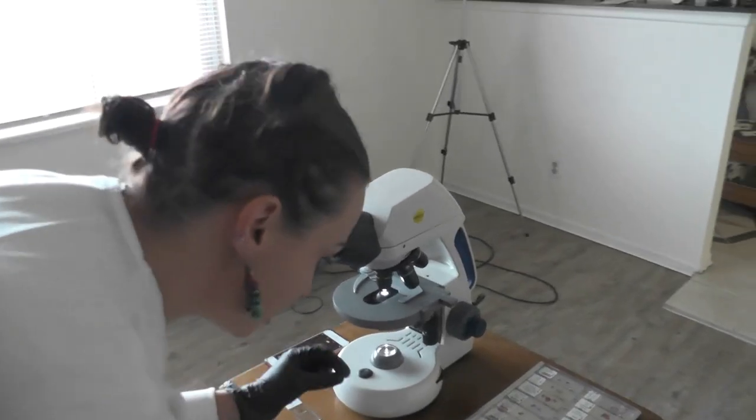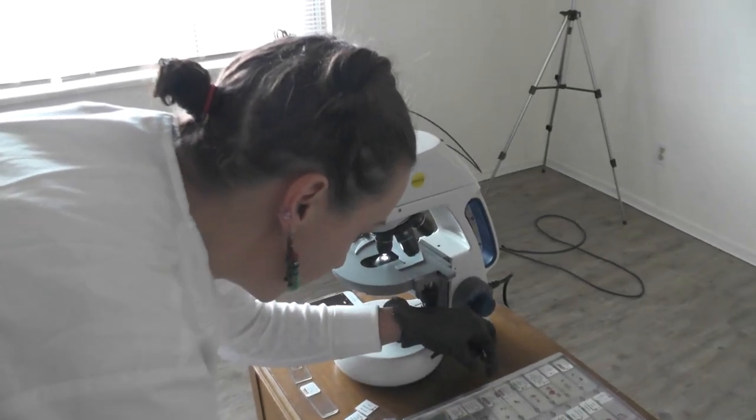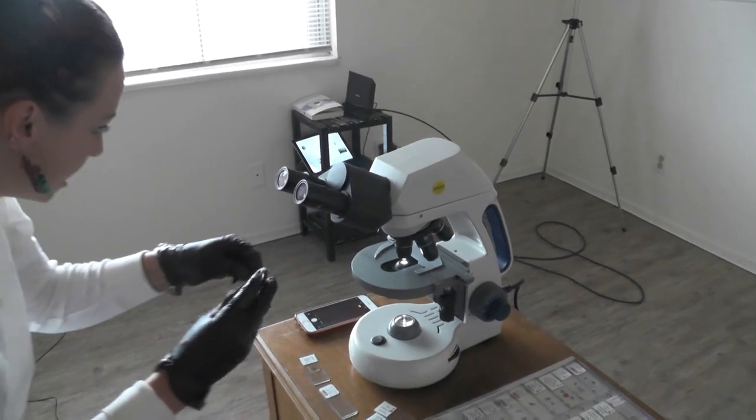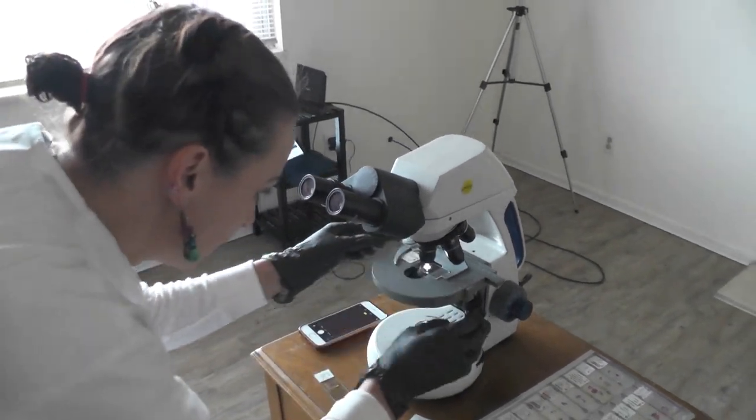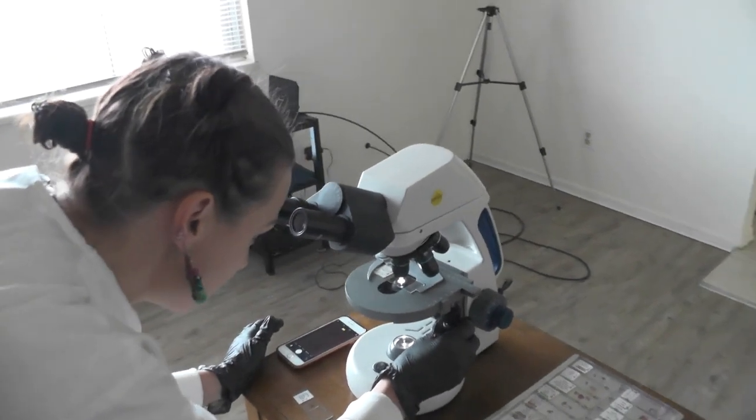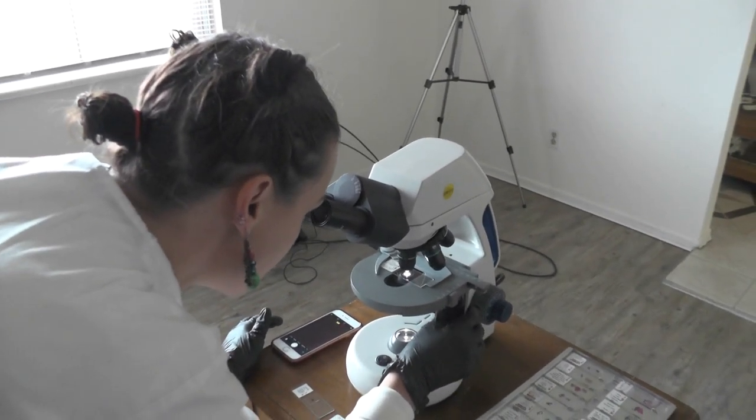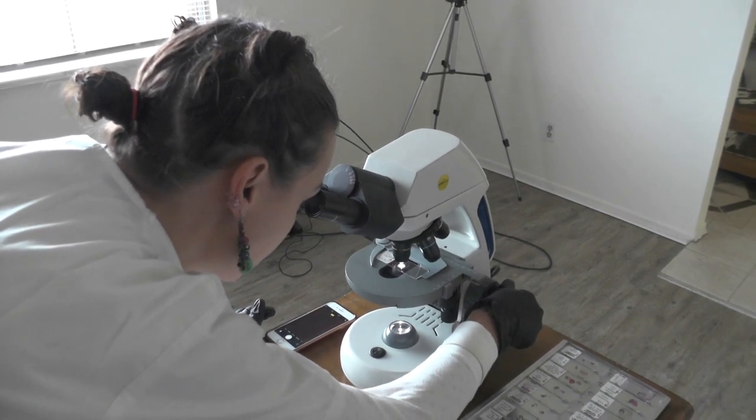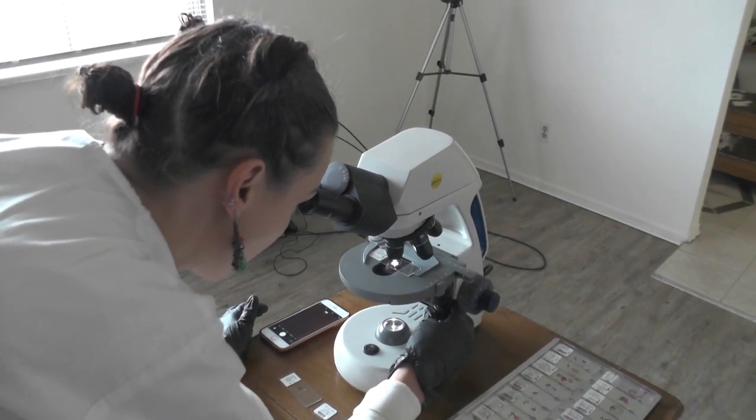Now the large intestine is going to be easiest to recognize because it's got a high proportion of goblet cells in the epithelium and that's because our goblet cells secrete mucus and we need to be able to lubricate the solid waste that's being formed.